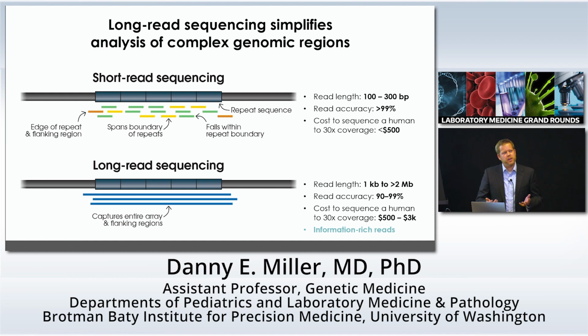So long-read sequencing solves this problem by simply being longer than the length of many of the repeats that we study. You're kind of cheating, right? You're just sequencing strands that are longer and they're easier to align or to assemble to the genome.